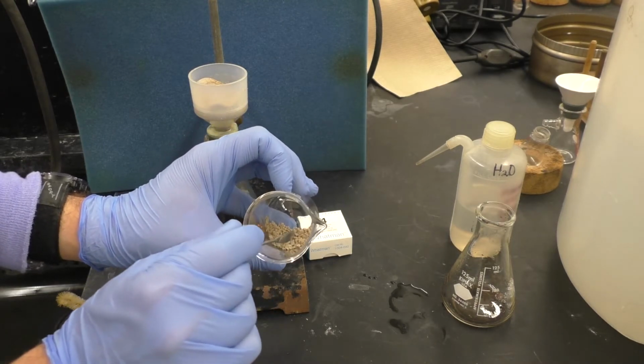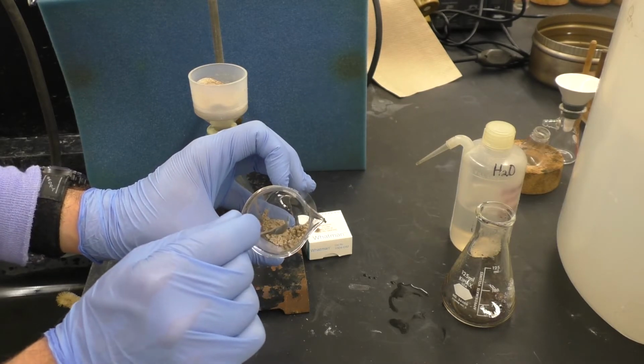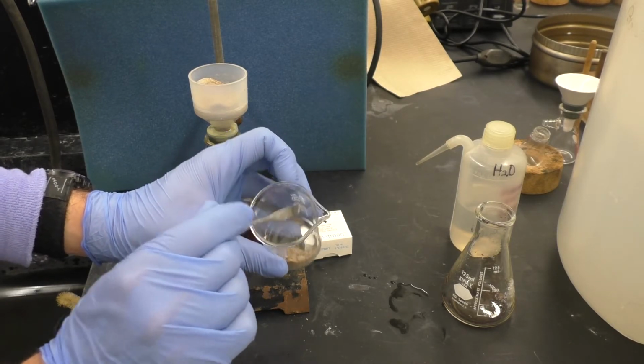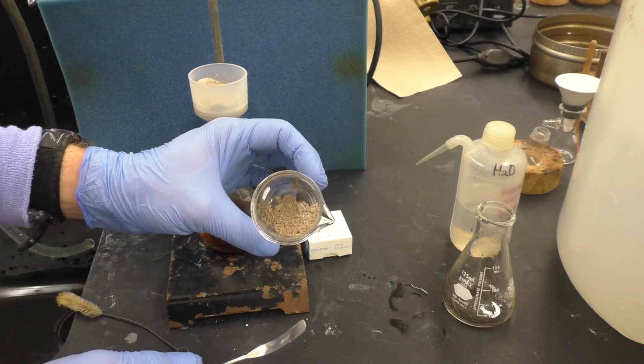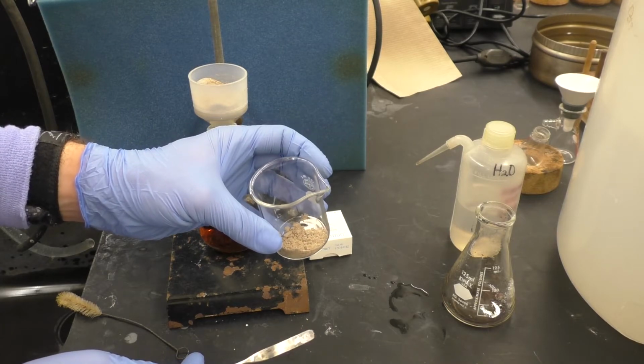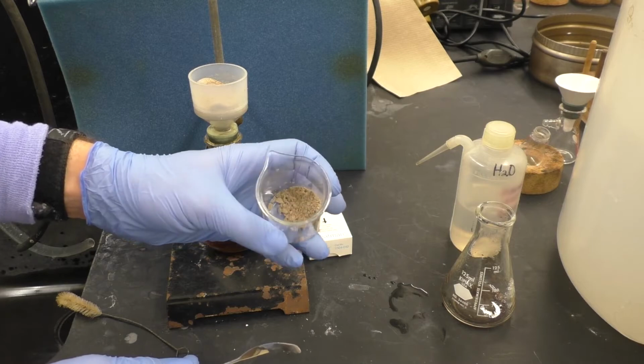Break the material up here to try to increase the surface area so it will dry faster when we put it in the oven. And we're all set to put this in the oven. Acetaminophen is supposed to melt around 169, so we should be safe to put this in the oven.